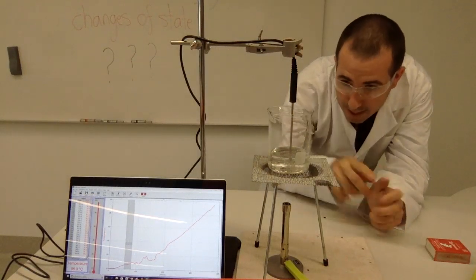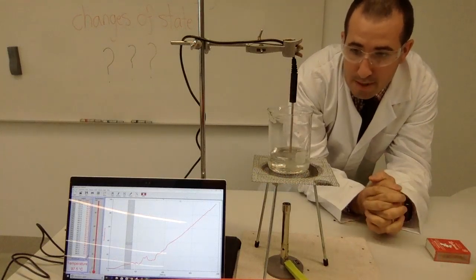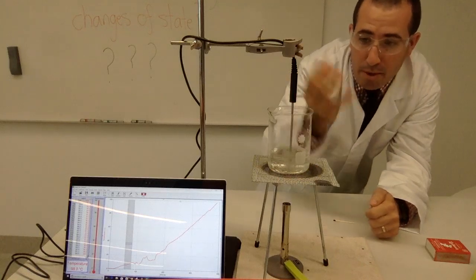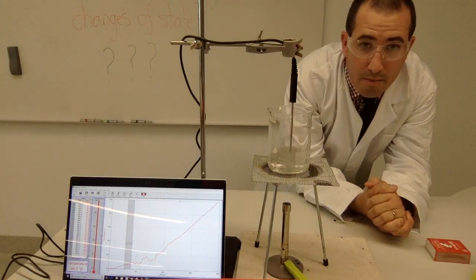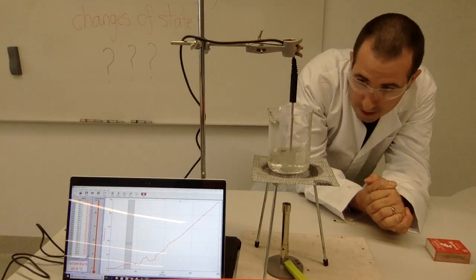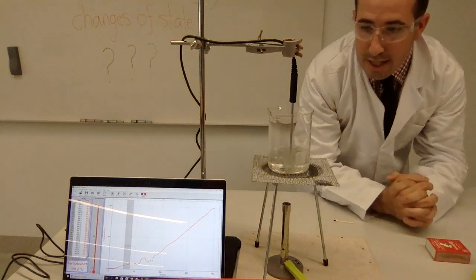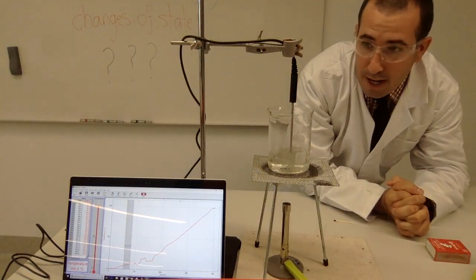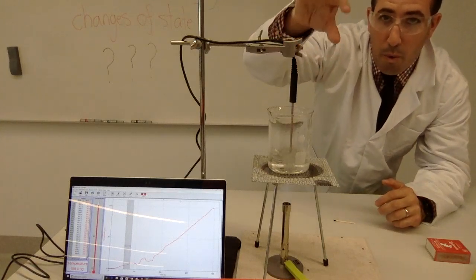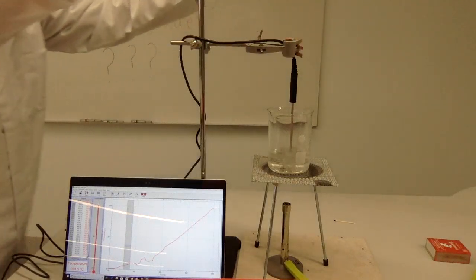And at the moment we can see gas particles are starting to rise up. That's the water vapor starting to be released from the bottom of the beaker up towards the top. So we're reaching almost the boiling state. So the process of boiling is occurring where it vigorously, with a lot of heat, changes the state of matter. And as you might see, there is some steam coming up. Steam all around the place.